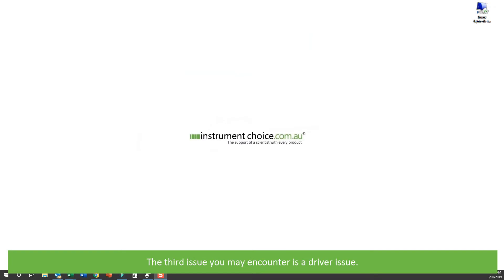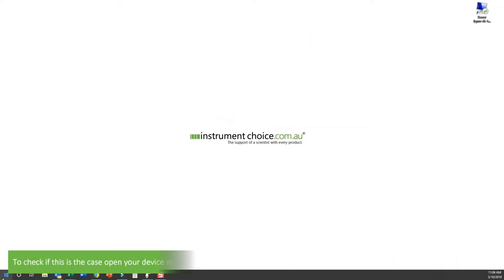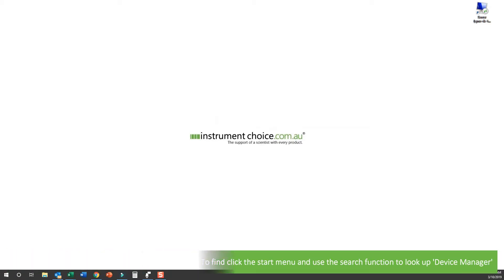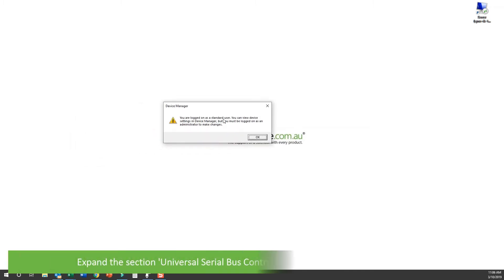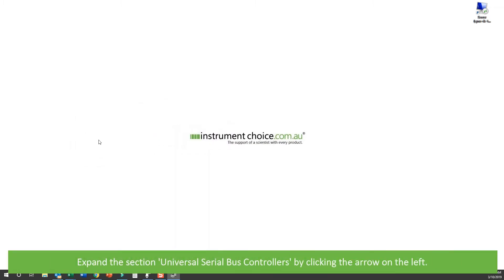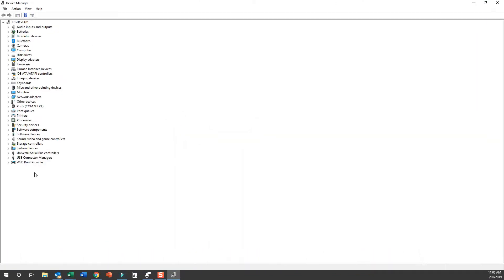The third issue you may encounter will be a driver issue. To check if this is the case, open your Device Manager. To find the Device Manager, simply click the Start menu and use the search function to find Device Manager. The Device Manager screen should look something like this. Expand the section 'Universal Serial Bus Controllers' by clicking the arrow on the left-hand side.